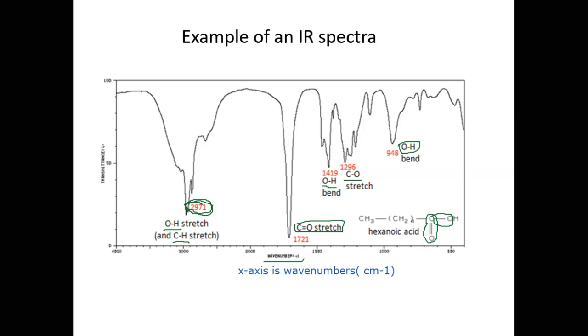So usually with our spectrum, you want to note the very strong frequencies. You don't have to note every little frequency, but the main frequencies that show up in the spectrum.